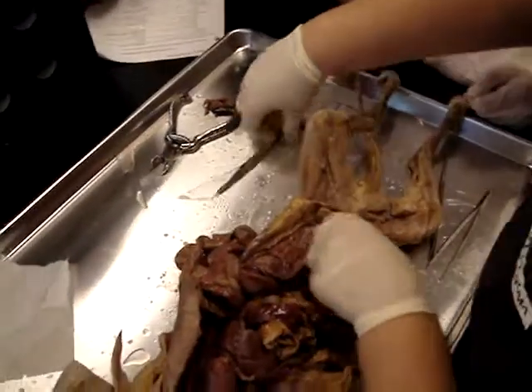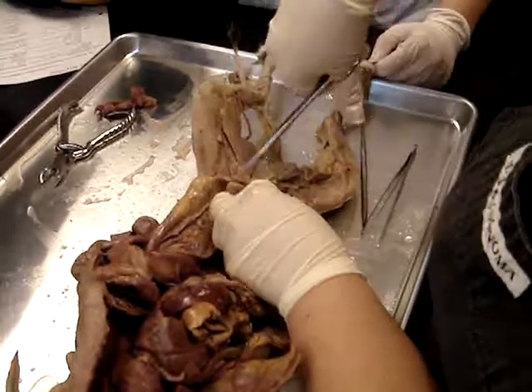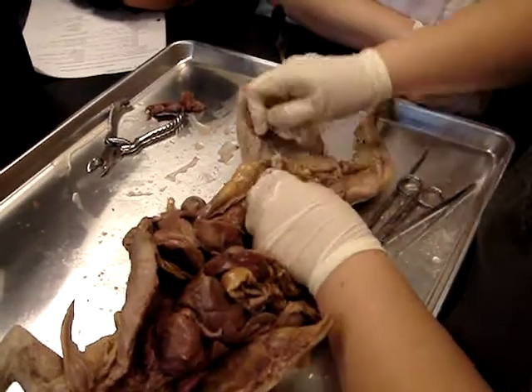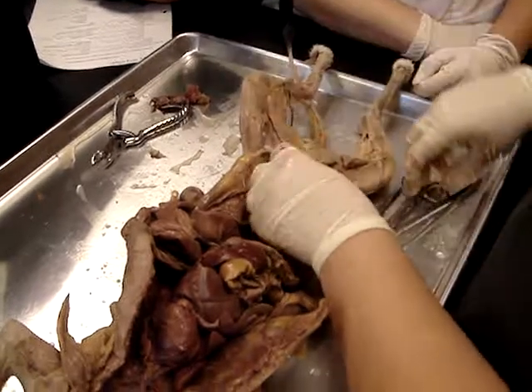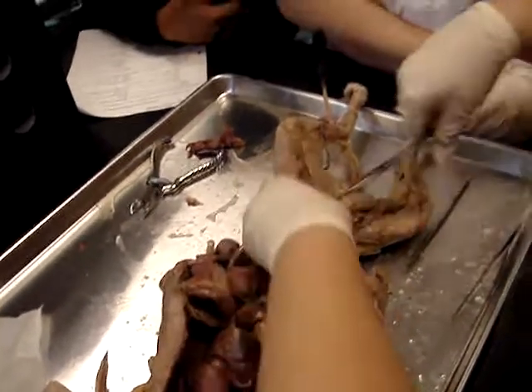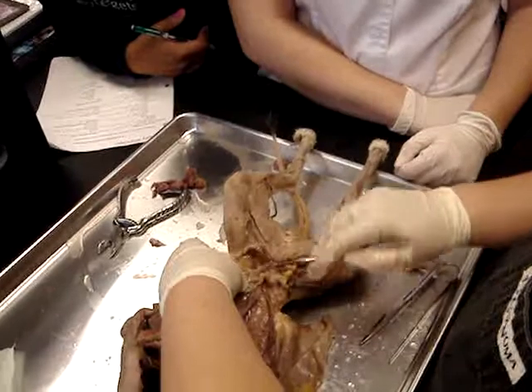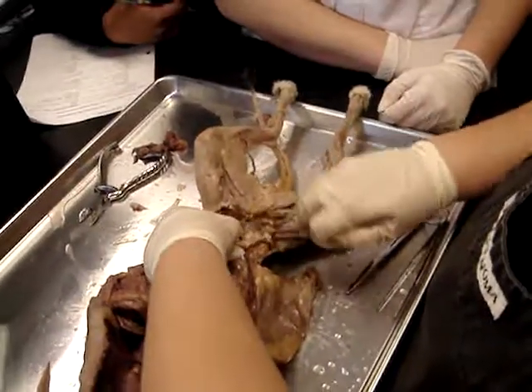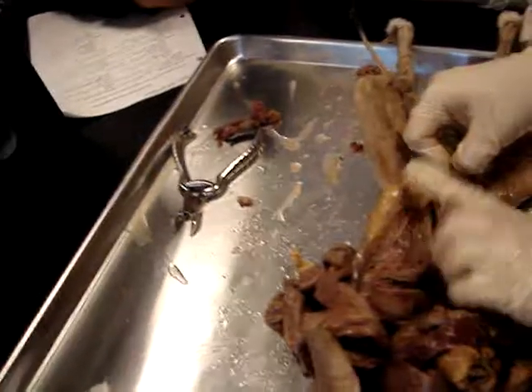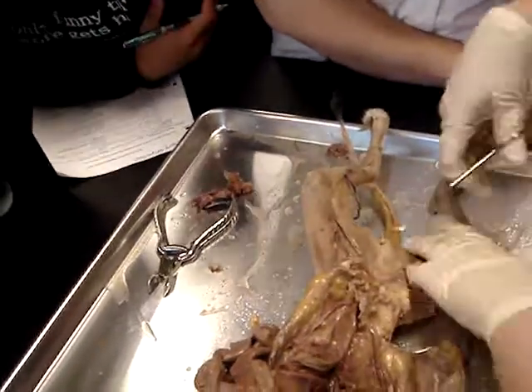Okay? Now we need to do some cutting. So we don't want to hurt our urinary bladder. But we do want to get rid of this fat. Being very stubborn. So all of this fat can kind of go. Right, so here's my urinary bladder. And so the little tube at the base of the urinary bladder must be the urethra. Okay. And so if I pull the urinary bladder forward, you can see the Y of the uterus, right? You can see where it splits. And so we want to actually get in there and look at all of this stuff.